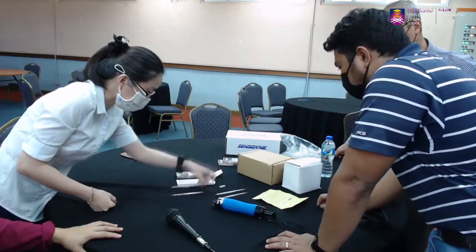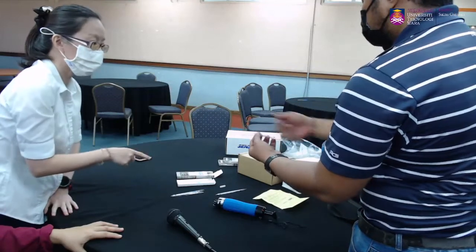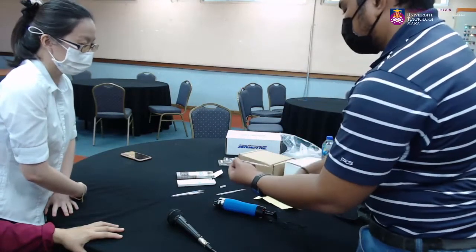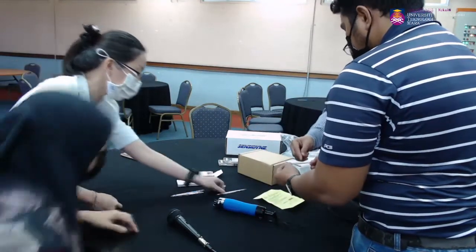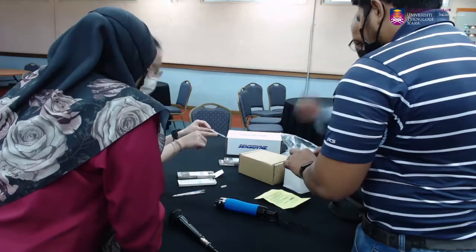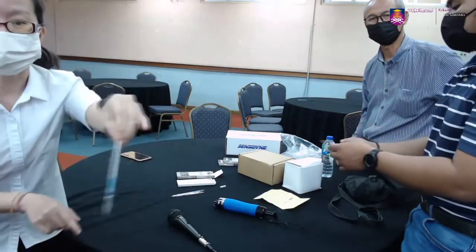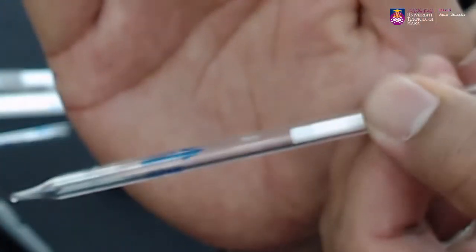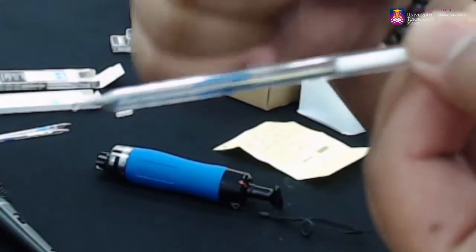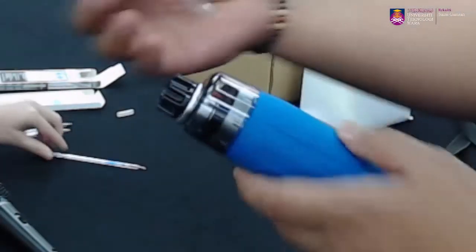Okay. So in terms of connection dia, kita kena identify, usually arrow is ke arah kita punya pump. Kalau kita pakai kat bahagian atas pun, still kita kena connect that flow. Setiap detector tube brand apa pun dia akan ada arrow tu. Daripada arrow tu kita boleh identify that is the flow yang masuk ke dalam pump. So connection dia usually macam ni lah.